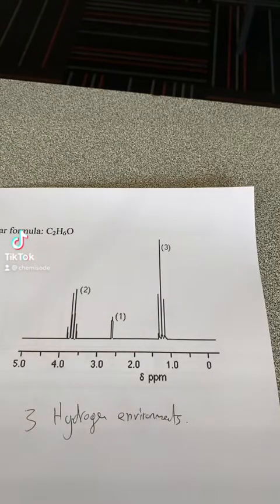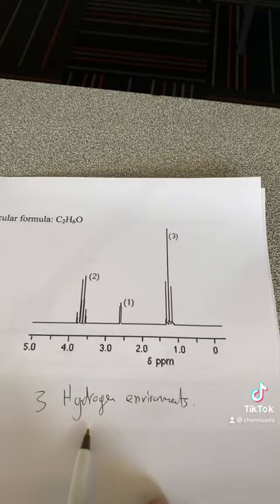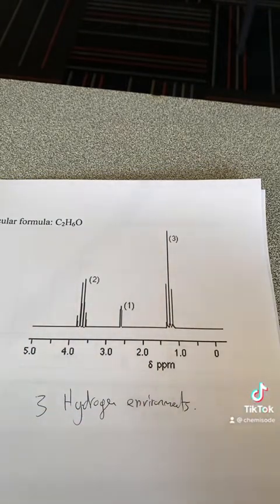Let's take a minute to analyse this hydrogen NMR spectrum. First of all, I can see that there's 3 hydrogen environments because there's 3 distinct peaks here. Let's have a look at each peak and work out what information can be gained from those.